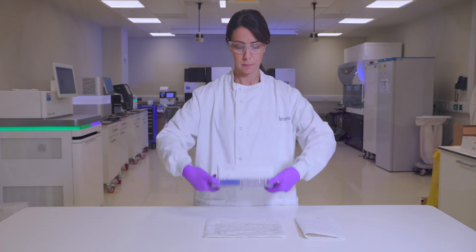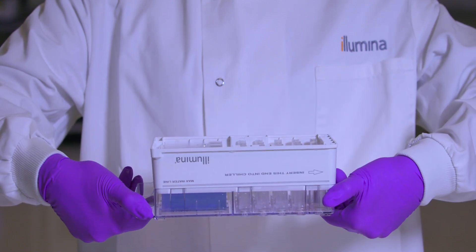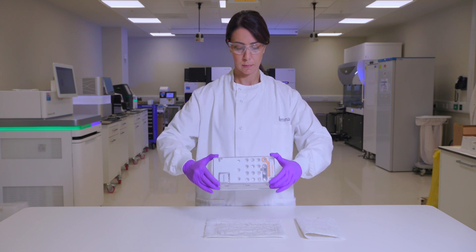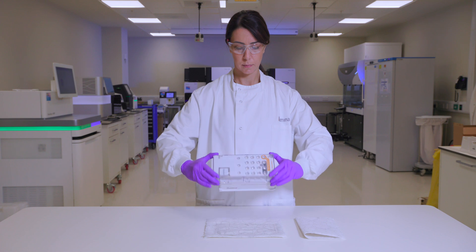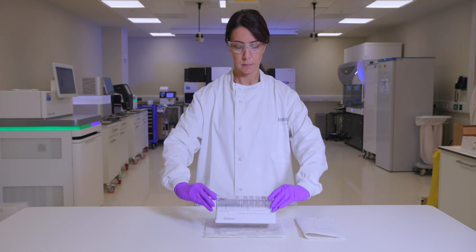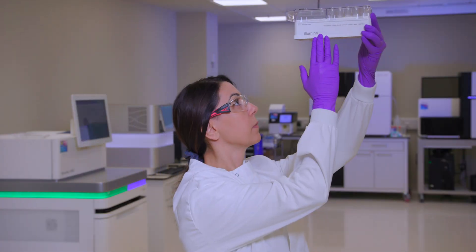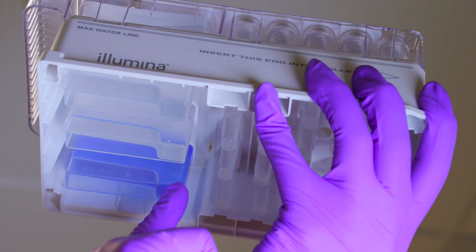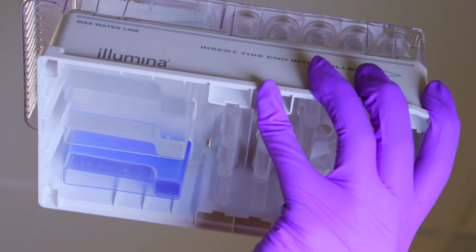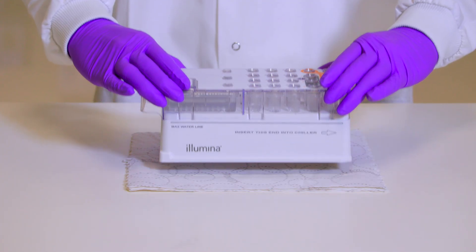Invert the cartridge 10 times to mix the thawed reagents, then inspect that all positions are thawed. Inspect the reagents in positions 1, 2, and 4 to make sure that they are fully mixed and free of precipitates. Gently tap the cartridge on the bench to reduce air bubbles in the reagents.